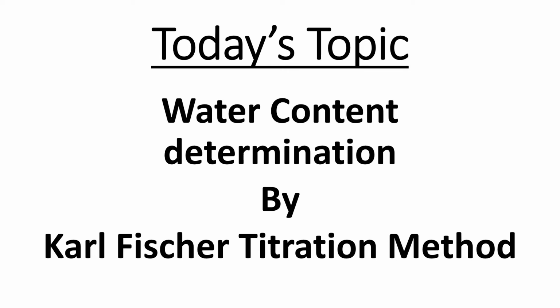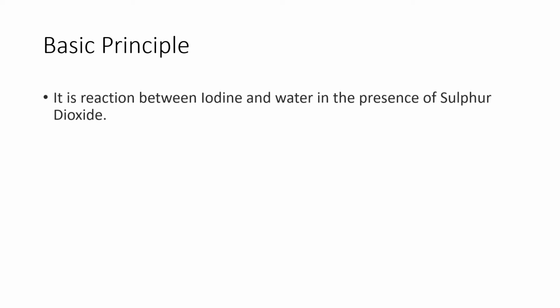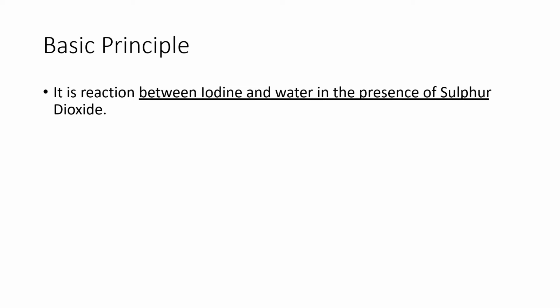Today's topic is water content determination by the Karl Fischer titration method. Let us understand the basic principle. It is a reaction between iodine and water in the presence of sulfur dioxide. The equation may look like this.